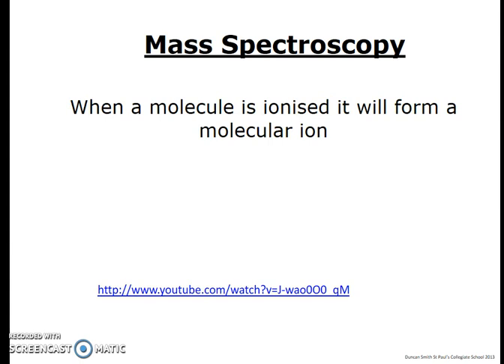The process of mass spectrometry involves taking a molecule, or rather a large amount of the molecule, in a gaseous form and ionizing it. We ionize it by bombarding it with a high energy stream of charged particles, usually either electrons or cations. When it does that, the molecule itself can become ionized, and it can also smash up into a million little teeny tiny fragments. How those fragments are formed is kind of unique to each molecule, so we can identify the structure of different isomers based on the fragments that are formed.